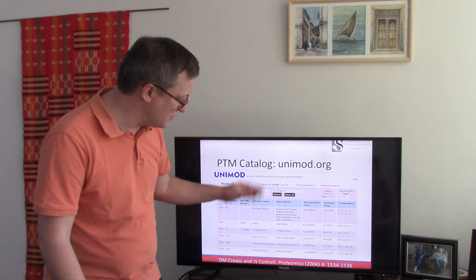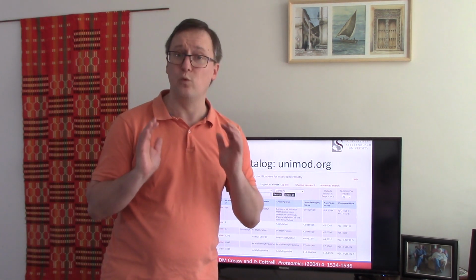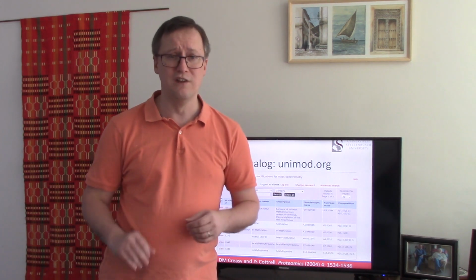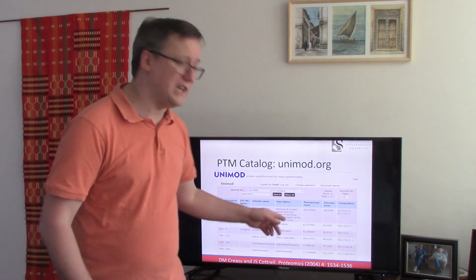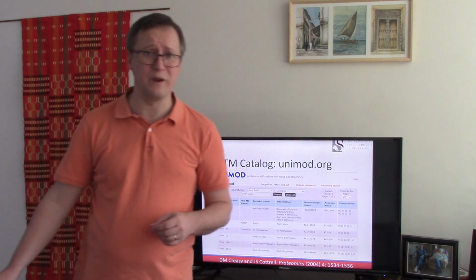So here we see that UniMod has been around for a long time, but has a very well-attested set of modifications for people to think about. Once you click into these, you'll even see that there are publications strapped to each of these to say, this is the publication that helped us to establish what chemistry is going on here, how many oxygens or carbons or nitrogens or whatever are involved, and so on. So it's a really great resource for that. Those papers are, by the way, worth reading.